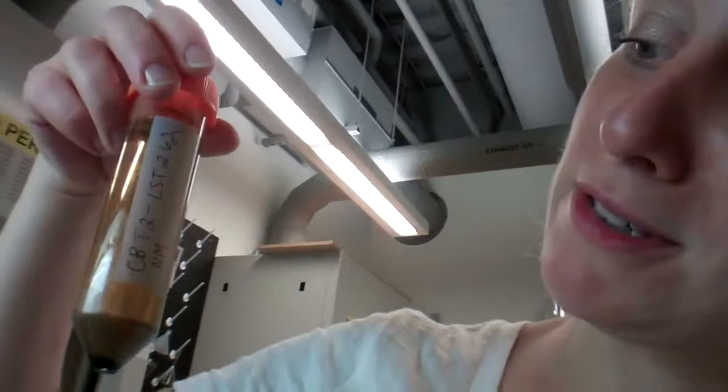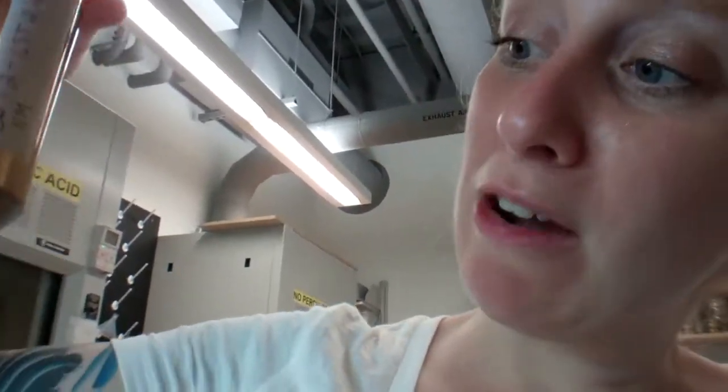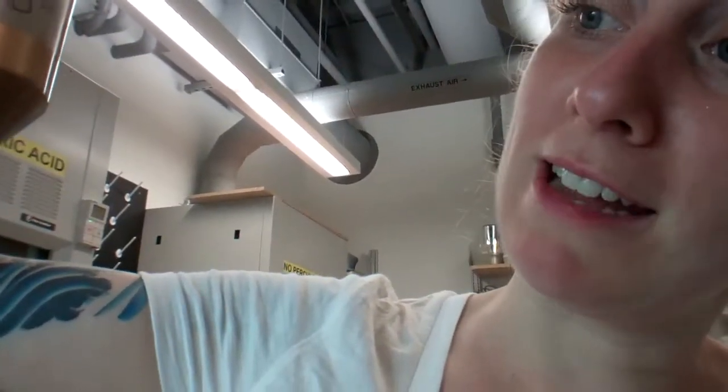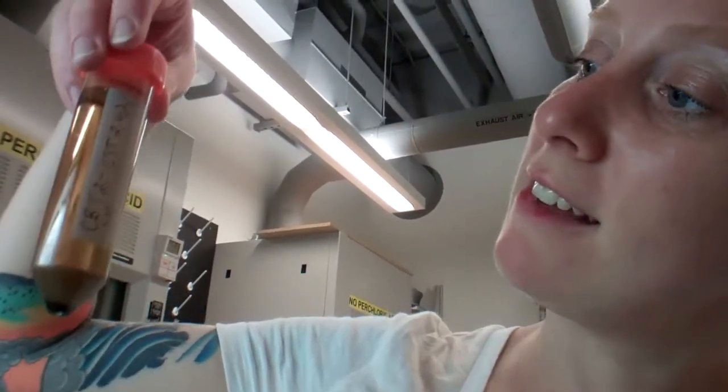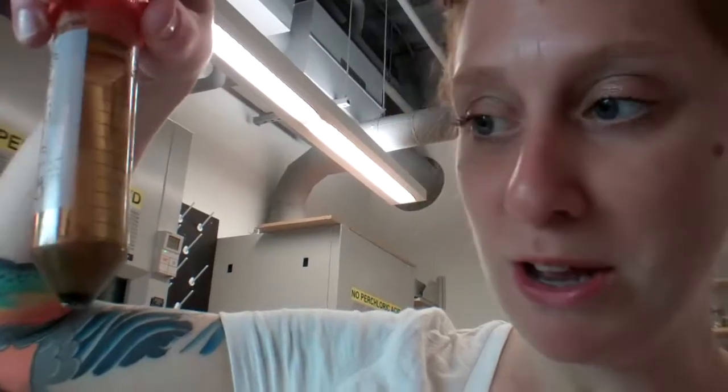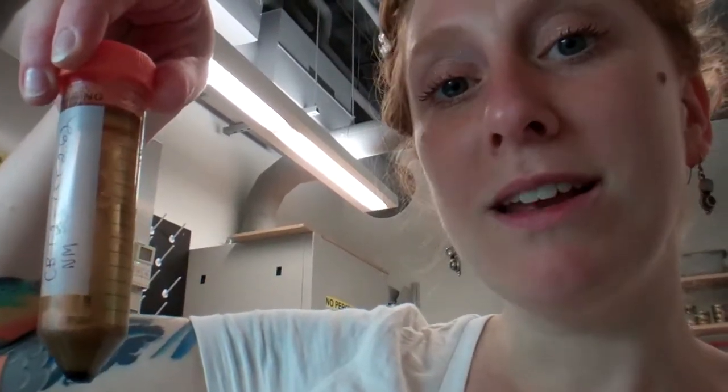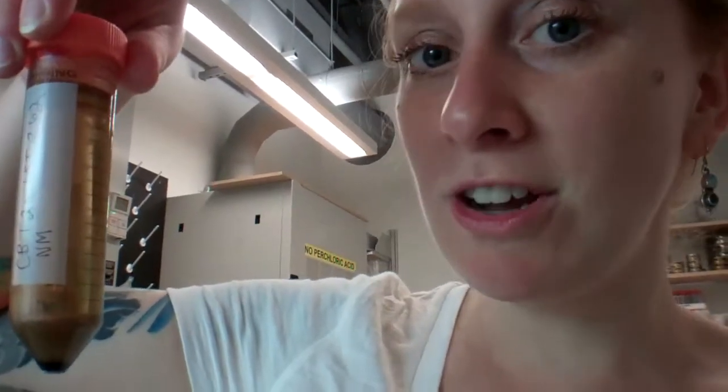Alright, so I have my sample CBT2 which was dry sieved and water sieved after being crushed, and now it's been sitting in LST 2.62. Everything that's more dense than 2.62 is now at the bottom, everything that is less dense is now at the top, so we have to separate these two. And for that we need liquid nitrogen. Get on your goggles folks, it's about to get crazy.